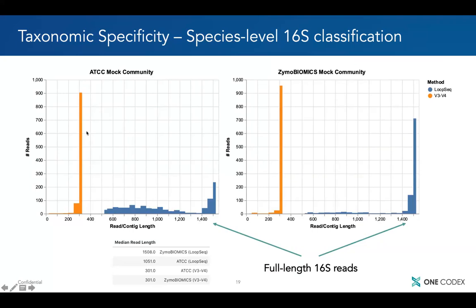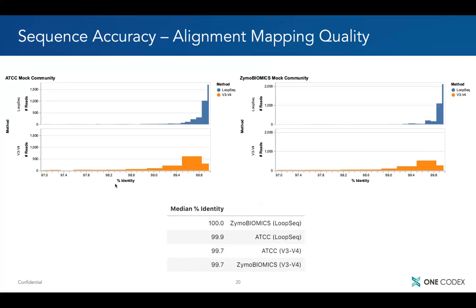In contrast to the short read data, and this is MiSeq 2x300 data, right? So this is as long as you can get on Illumina. It's all centered at exactly 300, which is what you'd expect. And these are the individual forward and reverse reads. They're not the paired. It would be at 600 if they were joined, depending on the overlap.